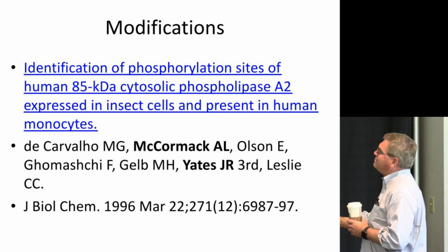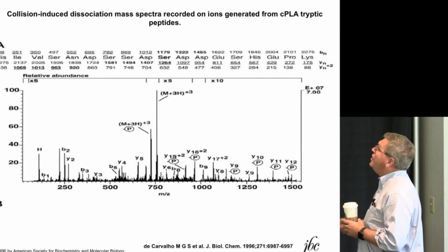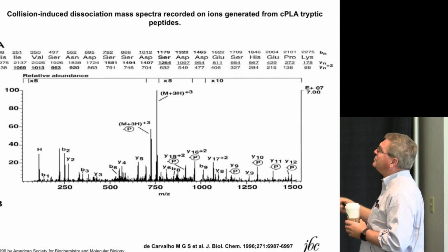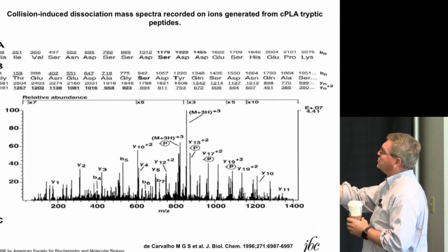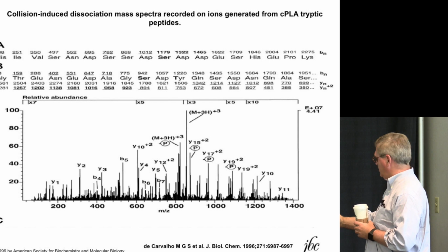So with Mike Gelb. And here's one of the phosphopeptides, beautiful spectrum. There's another one, almost a beautiful spectrum. You can see the spectra back then were a little noisy.